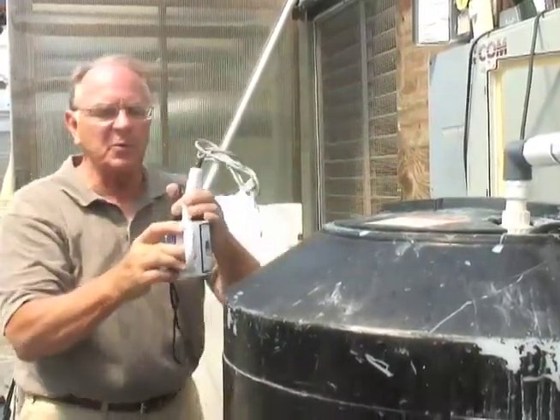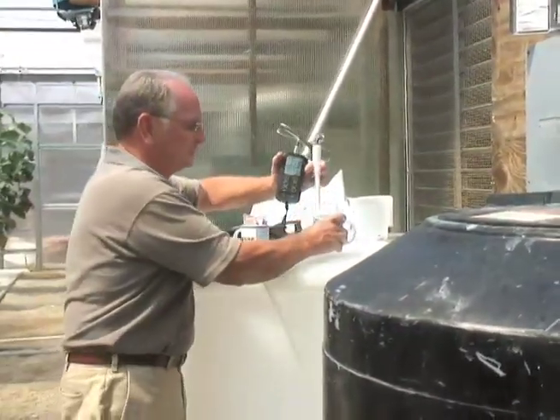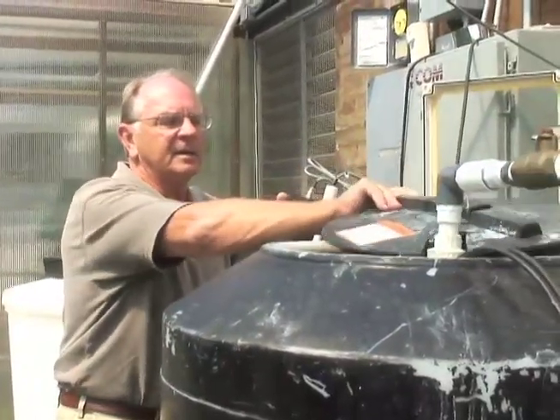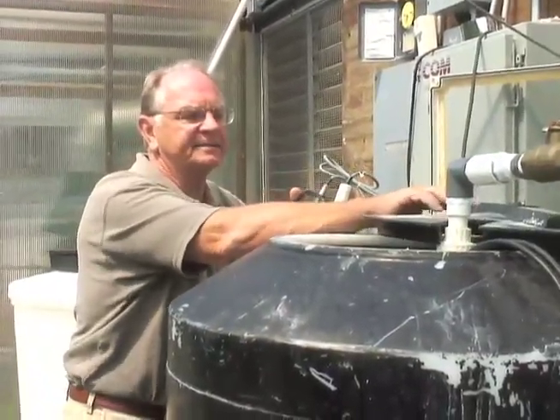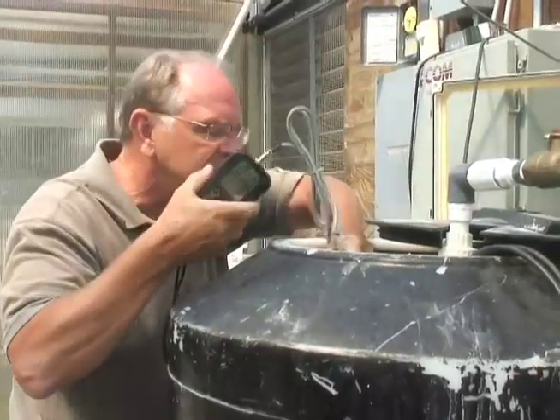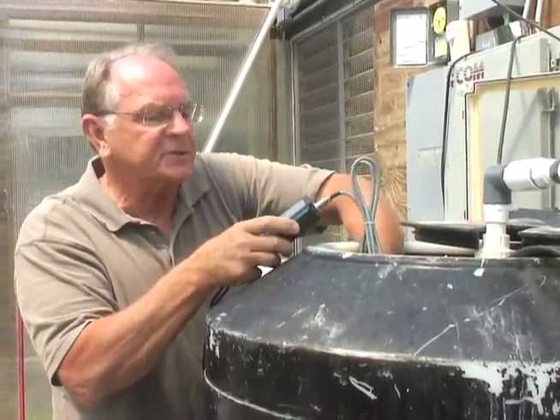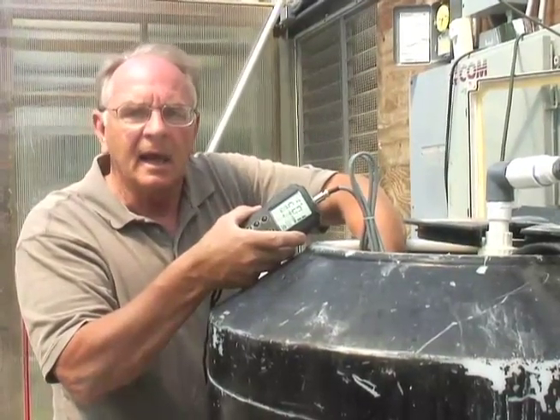Alternatively, with the extended probe version, we can actually measure directly by placing it into the tank and then reading. We get both the pH and the EC reading right from the tank — and that's it.